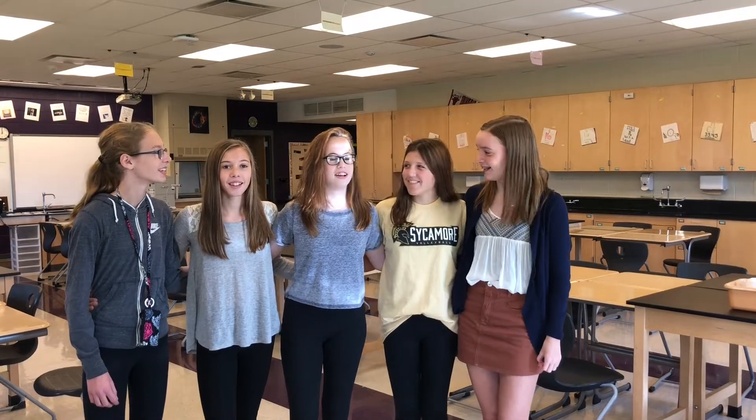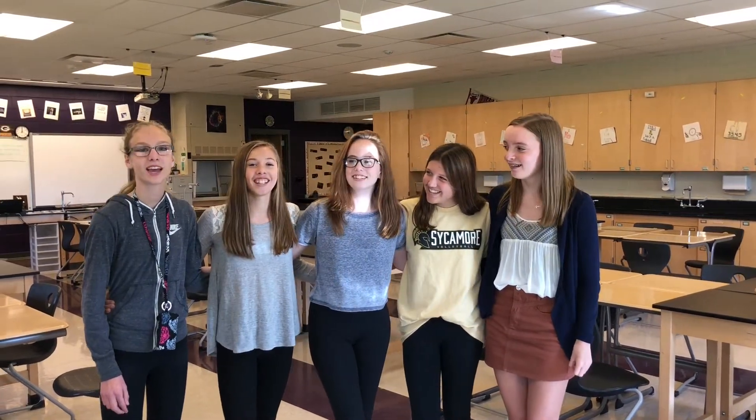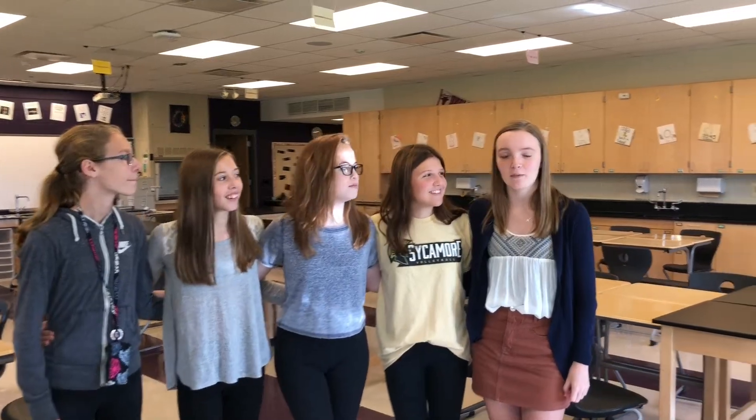Hi, I'm Macy. Hi, I'm Abby. I'm Sinead. I'm Finley. I'm Maddie. The objective of this lab is to observe physical and chemical properties. Make sure that you're writing down all your data on your worksheet.